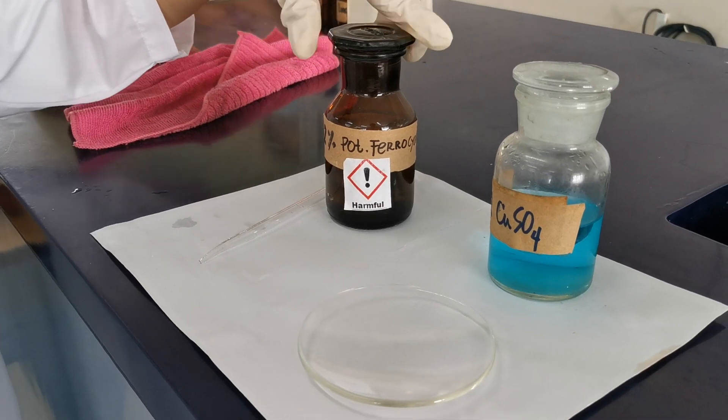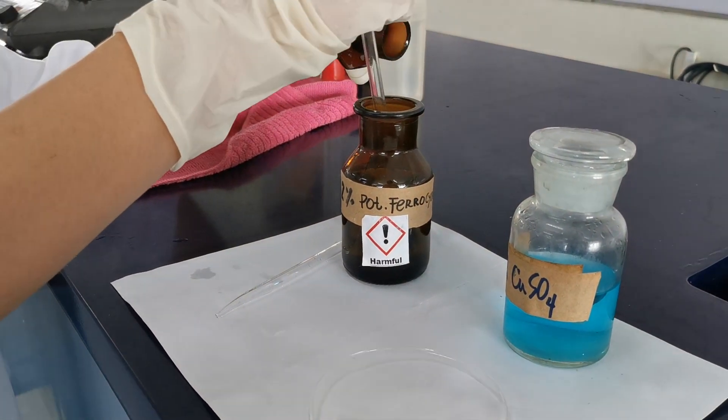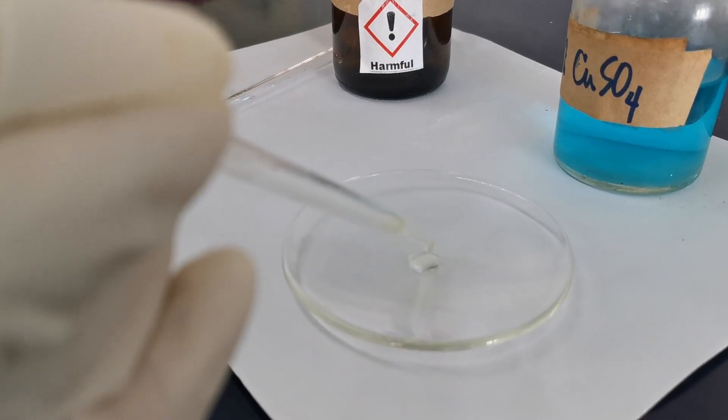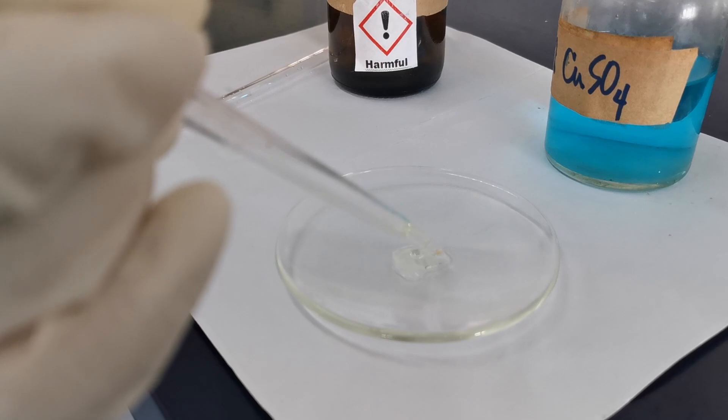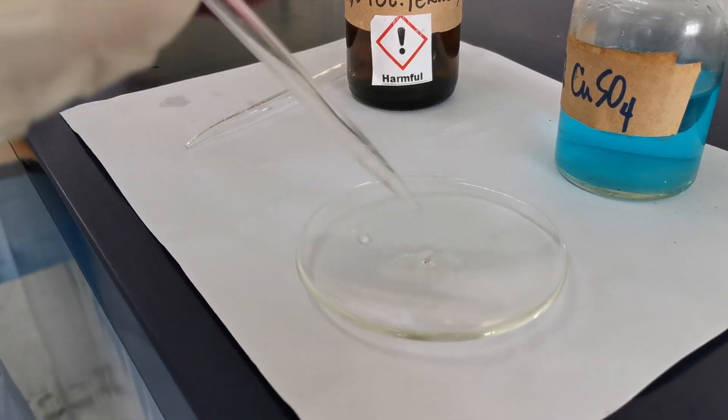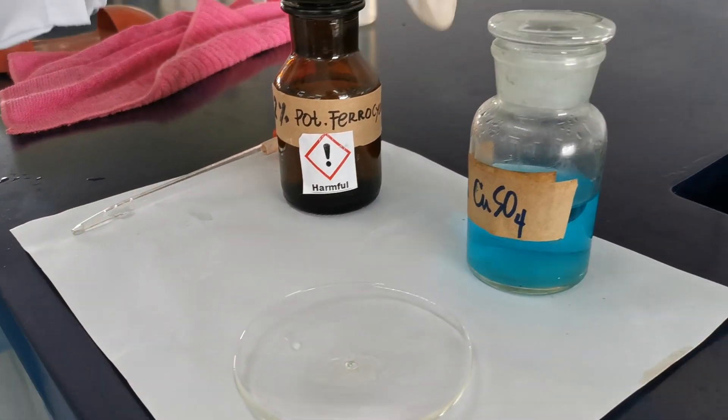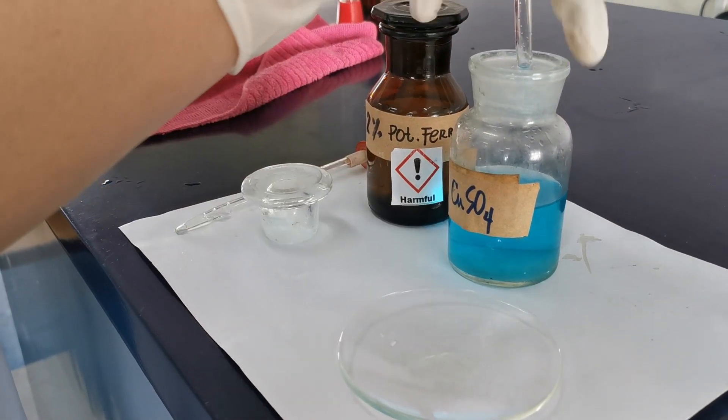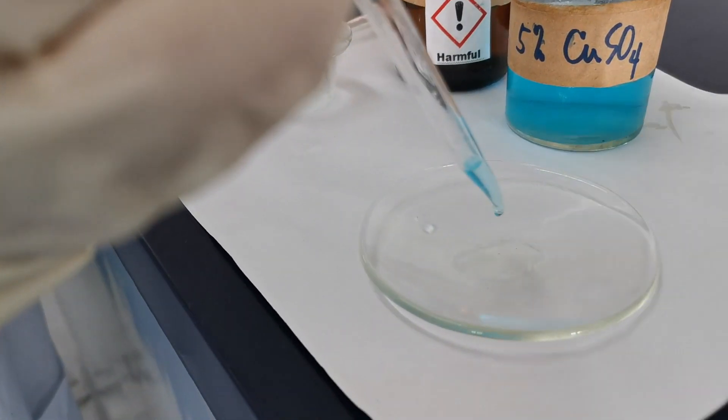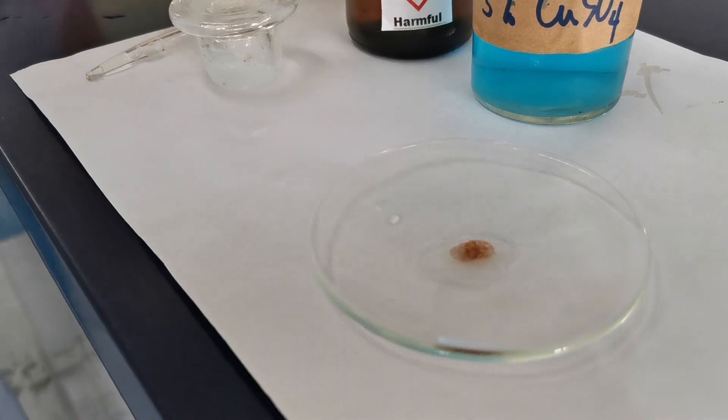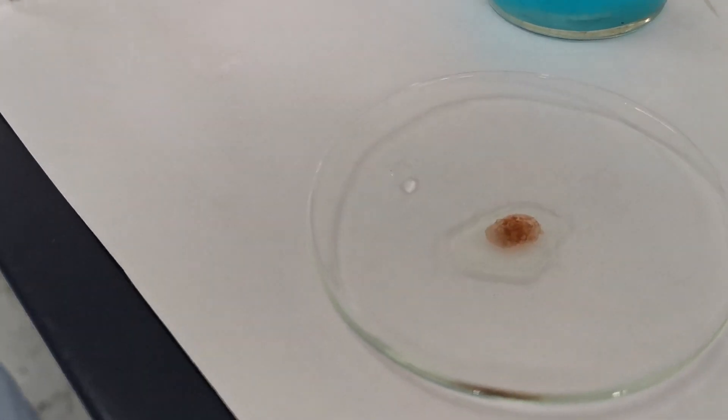Next, with a medicine dropper or pipette, carefully place a small drop of 5% copper sulfate solution on a watch glass containing 2% potassium ferrocyanide solution. A membrane forms around the copper sulfate drop. This membrane is semi-permeable. That is, it is permeable to water molecules but not to the solutes present.